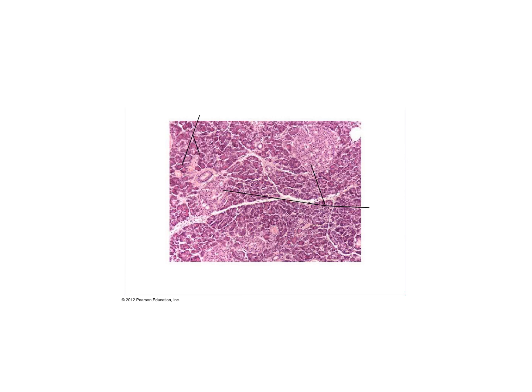All right, this is the pancreas again, a closer picture, and it's a different stain so we can see it a little better. This line is going to the pancreatic islets right here and right here. We can see the blood vessel that is located right here. And then this line is going to the acinar cells, the acinar tissue.